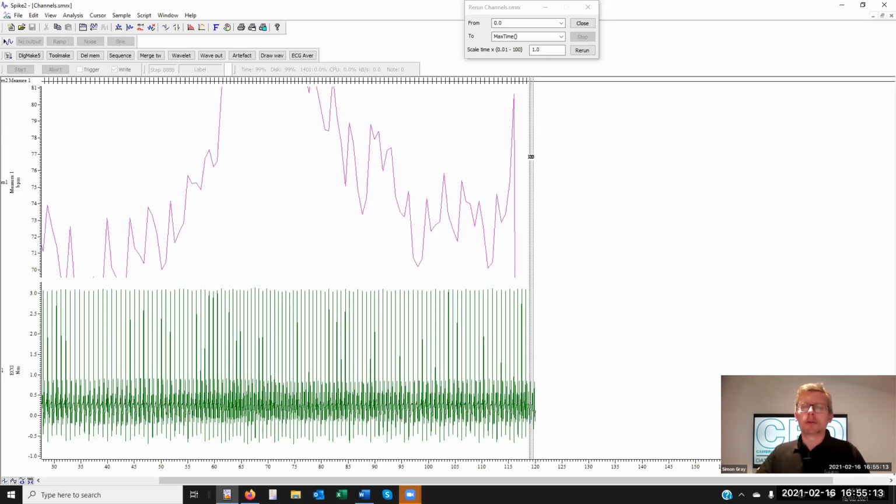Often it's better to use a script to automate functions just like this. For example, there was a guy, I won't mention his name, many years ago.